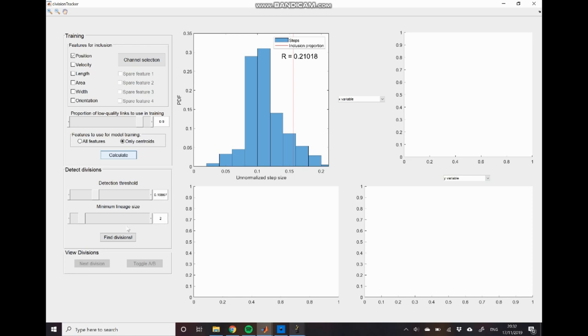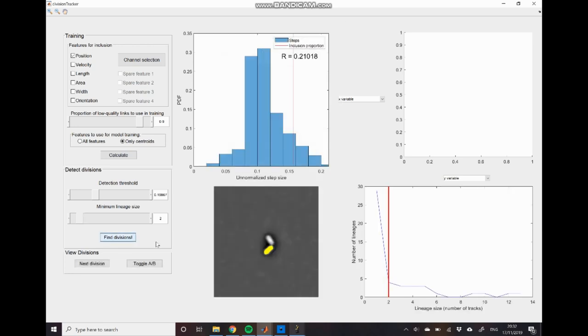So we'll now perform the main division detection stage. We'll just use the default settings for this. I'll click find divisions and you can see that we have these two different windows that have now changed. We have this division viewer window which allows us to view individual division events as they've been detected.